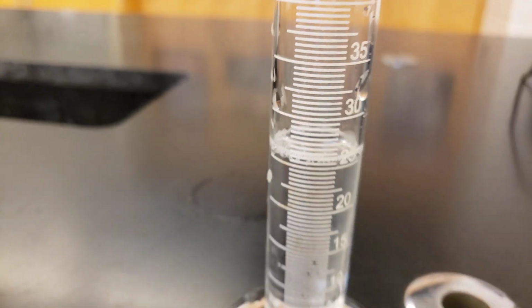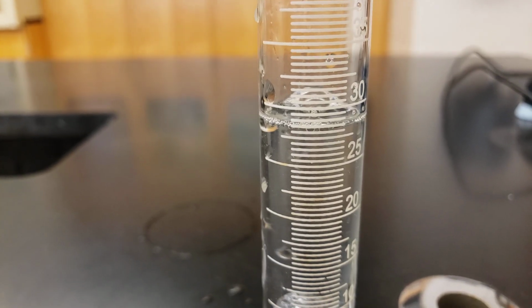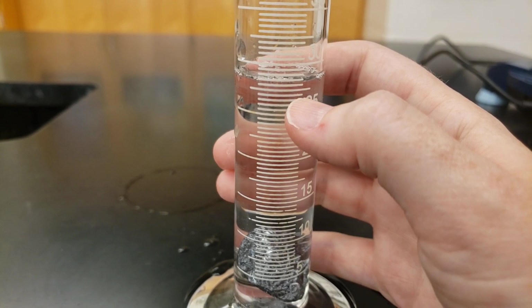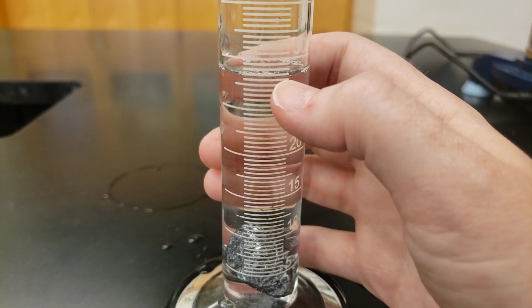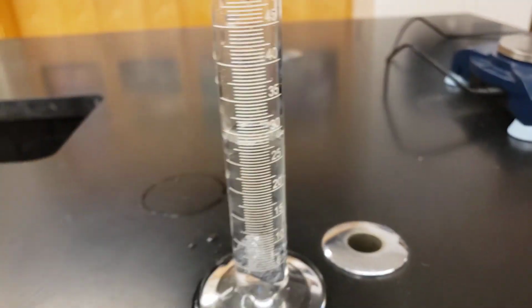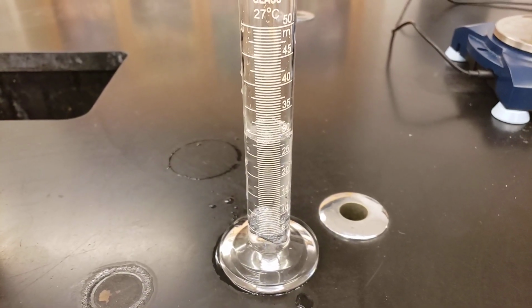So you can see that right now my water is right at 25 milliliters. So then when I add my silicon, it goes up all the way to, so we're at 25. Each one of these lines counts as 0.5. So we have 25.5, 26, 26.5, 27, 27.5, 28, and it looks like it is right at 28.50. 28.50 is our new volume. Based on that information, you should be able to calculate what the volume of the silicon was that I added to this graduated cylinder.